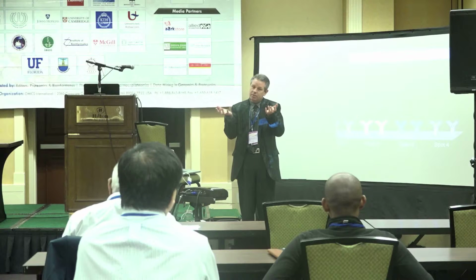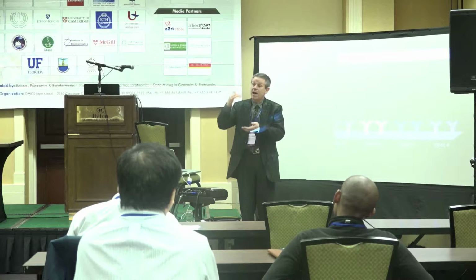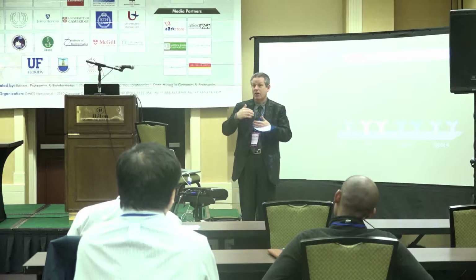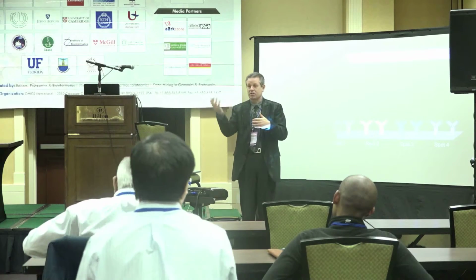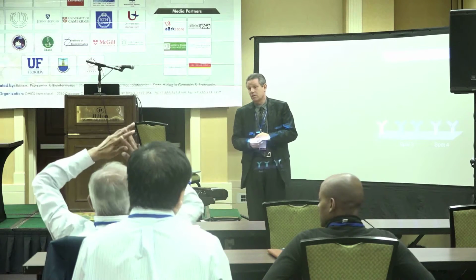And then what happens is, if you do that, the worst case scenario is you make changes not as dramatic as they actually are, but you don't make changes appear greater than they actually are. So we normalize all the data. We have the raw data, but we also normalize, and then we calculate the averages and the percent change from control, and calculate z-scores. And that is therefore a global normalization.